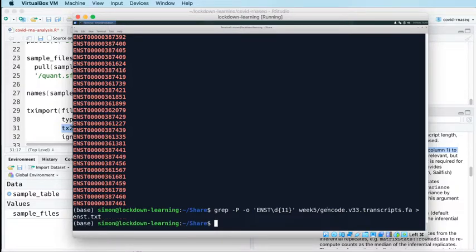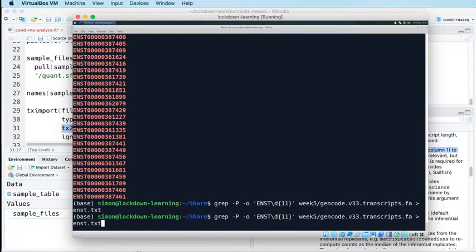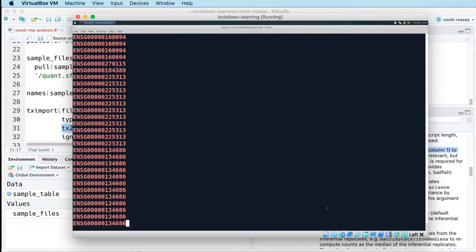And then we want to do the same, but for the Ensembl Gene identifiers. Well, the Ensembl Gene identifiers are identical to the Ensembl transcript identifiers, except they're ENSG identifiers, not ENST identifiers. And so again, if we run the grep without redirecting it, so it's exactly the same grep, but this time for ENSG rather than ENST. And if we run it without redirecting the output, again, you'll see those ENSG identifiers scroll down the screen. And you can see, even when they're scrolling past this quickly, that lots of these are repeated quite a lot of times.